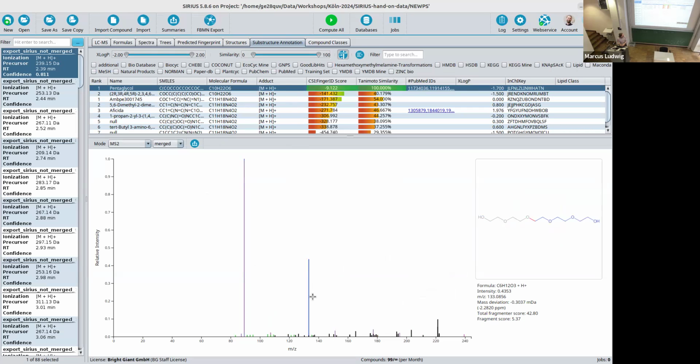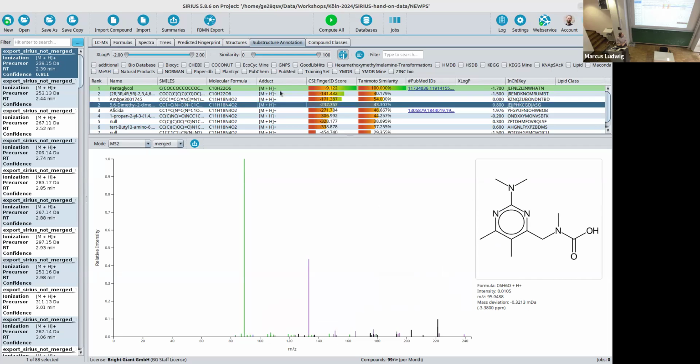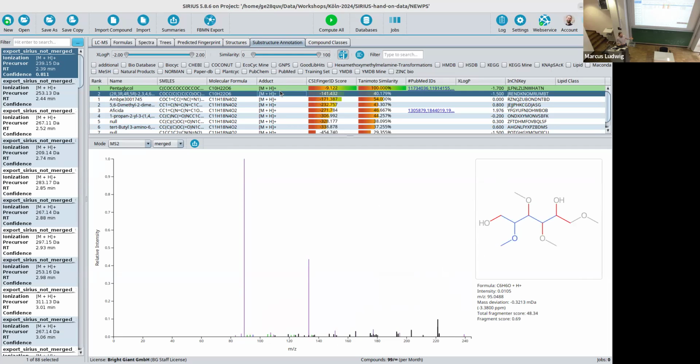These are the high peaks, the purple ones. But then the green ones down below are all annotated with molecular formulas, but we cannot find any substructure in here that explains them. In principle, you want a spectrum which is all purple, with all the peaks explained by substructures, but obviously this cannot always work, because if there are rearrangements in the structure, we cannot assign them to a peak, because we only try to find substructures.